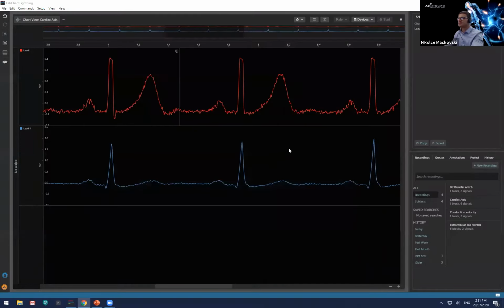Okay, so to explain this, the best way would be to go through some data sets. I'll go through a few types of data sets here, and also examples of when to use custom calculations. If you're not familiar with Lightning at all, I do have some past webinars on this, and please email me and I can forward you those. But if you are familiar with this, then it may look quite different from what you're used to.